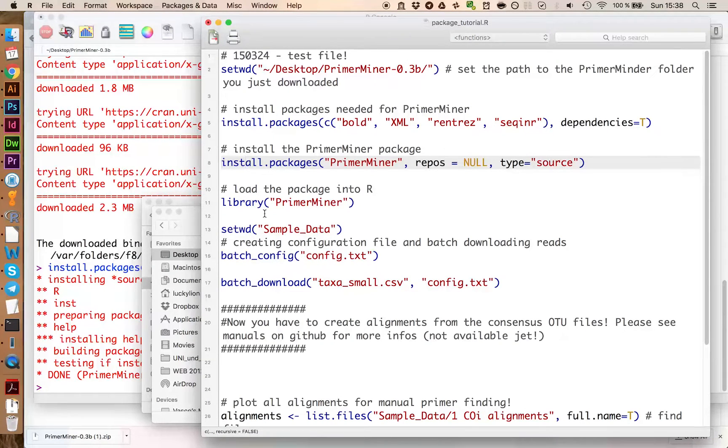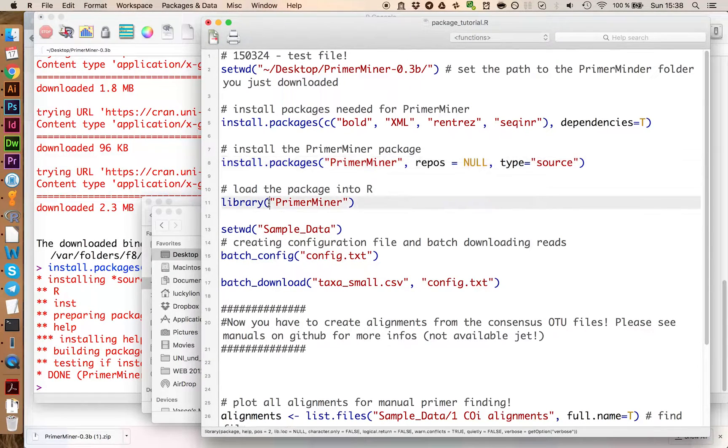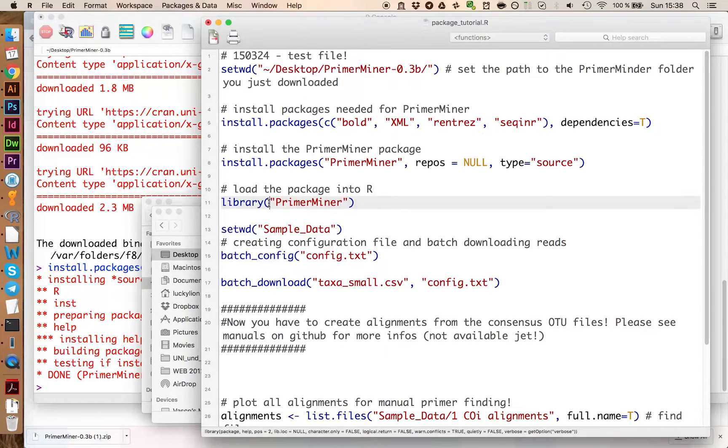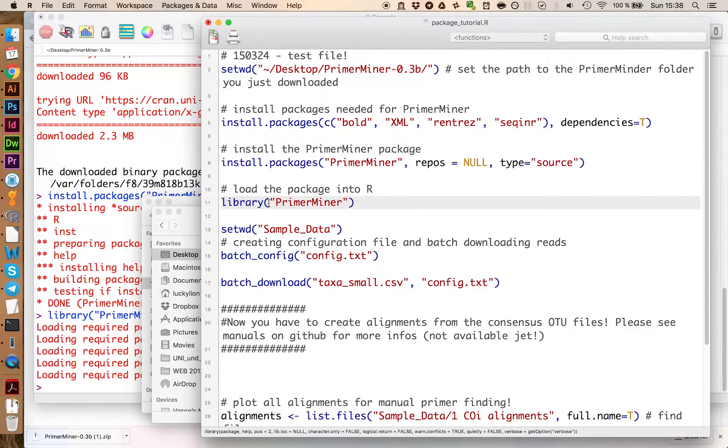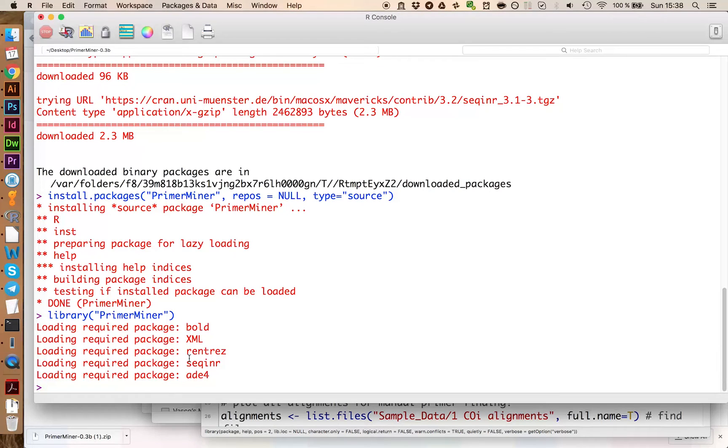To load PrimerMiner you can run the next command, library PrimerMiner, and you see that PrimerMiner did load successfully.